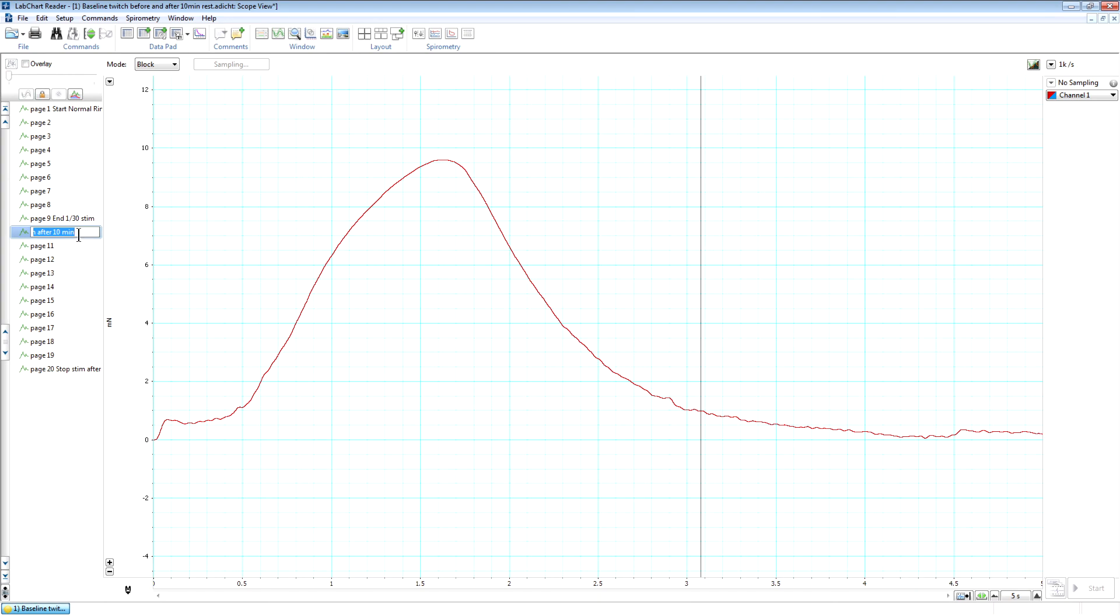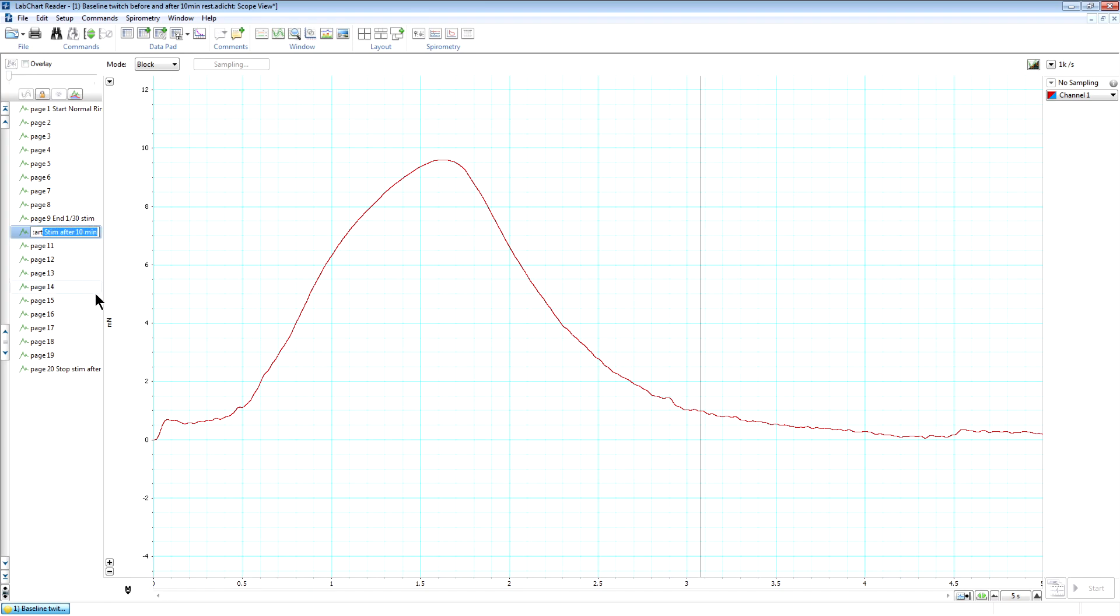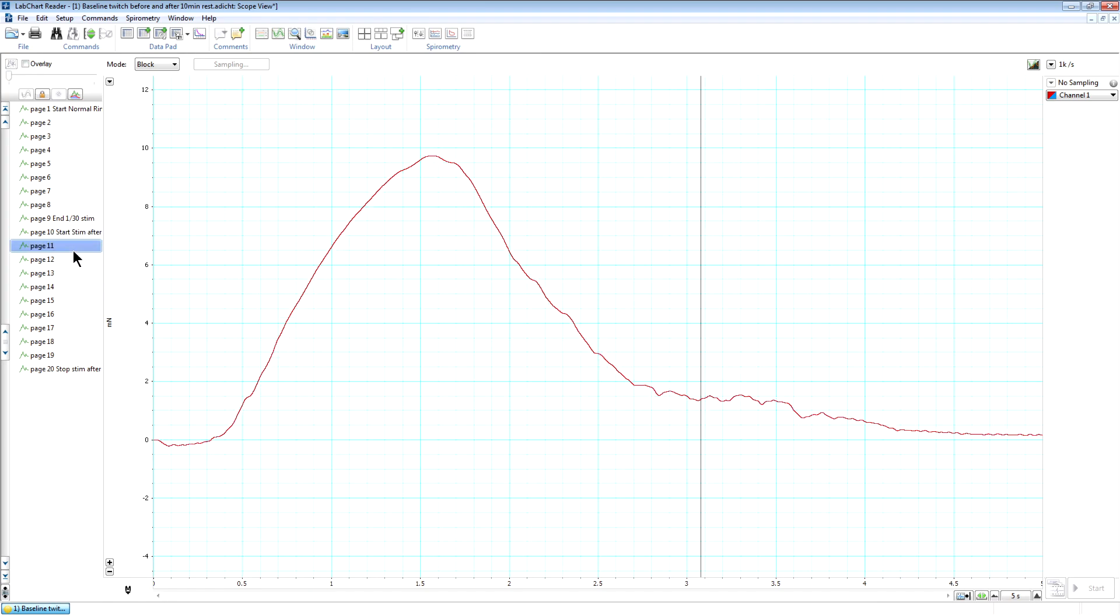A window shows up which lets you type in the new name for that page. But we can use it in order to just scroll along and read what the rest of that name is. So if you're having trouble reading some names that are cut off, then just use that Rename trick in order to be able to see what the rest of that label says.